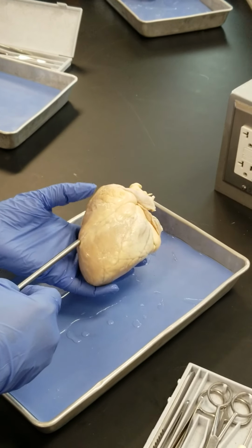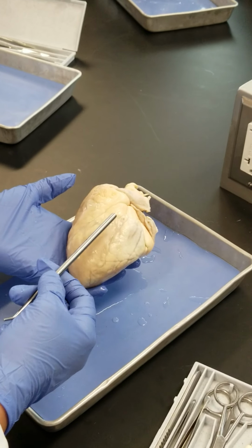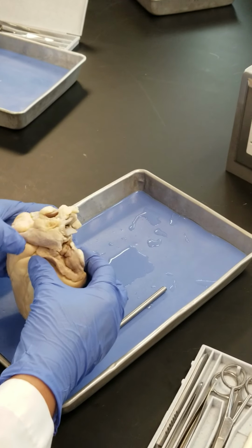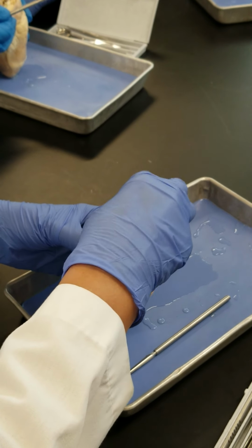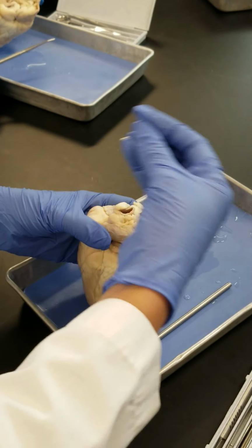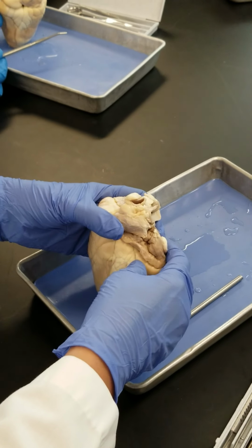After you recognize which side is anterior and posterior, you can name this anterior or posterior, right? So the clue is all about these vessels that are coming out of the heart, or in other words, connecting. Some of them are bringing the blood out, some of them are bringing the blood inside of the heart, right?